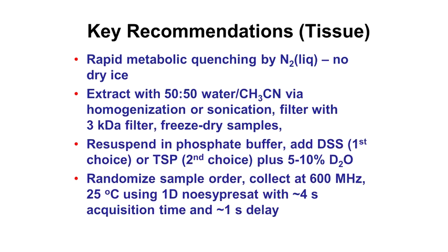So that's the biofluids. There's tissues. Again, tissues are metabolically active, so you have to quench things quickly, within minutes or even seconds if you can. In order to convert tissues into something that's a fluid, you should extract them. Water or acetonitrile is typically used, and there's some homogenization or sonication. Then you filter to get rid of the proteins and other particulates. And then you freeze dry the samples.